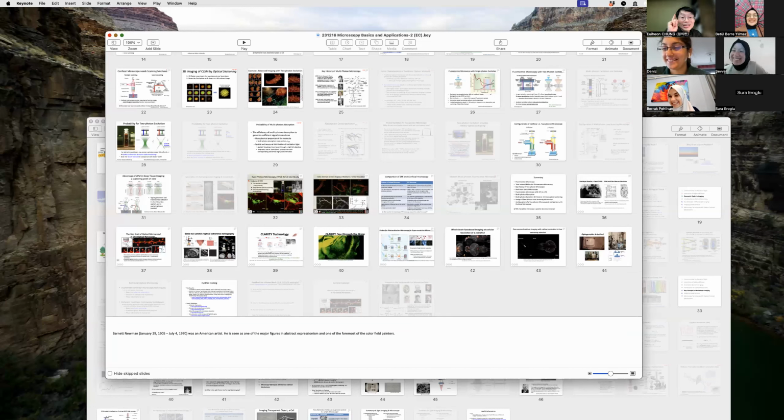So electron in one aspect can be considered as having a very short wavelength. You can create an electromagnetic lens and create an electron microscope. Okay. So yeah, this is a little beyond, but that's why you are using electron microscope for looking at tiny things inside the synapse. What molecules are there, what kind of receptors are there.